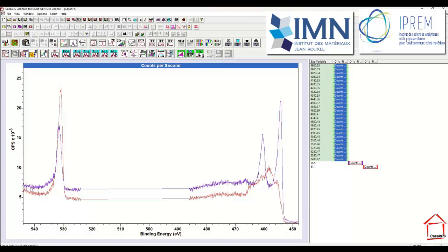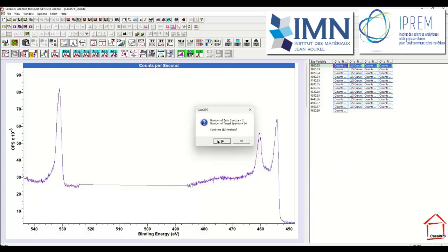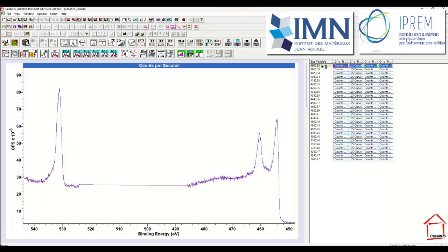So I press the button and a new file will be created that contains the data, the two component spectra scaled, and the sum of the two component spectra in the least square sense so that they match these individual VAMAS blocks. So I'm going to perform that calculation, and we see the new file. There's the original data, the least squares, that's the sum of the different component spectra, two component spectra summed to give the least square solution in the correct proportions.